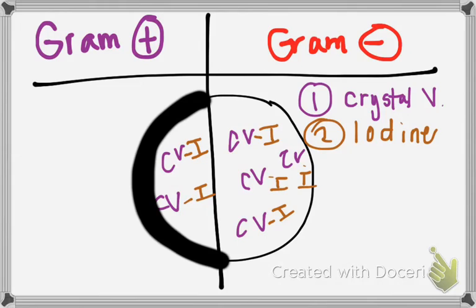And the other side is really thin. Okay, step 3, I guess black will work. Step 3, you're going to use a decolorizer. It's basically fingernail polish remover and an alcohol mixed, so you want to know what it's made of. Decolorizer.